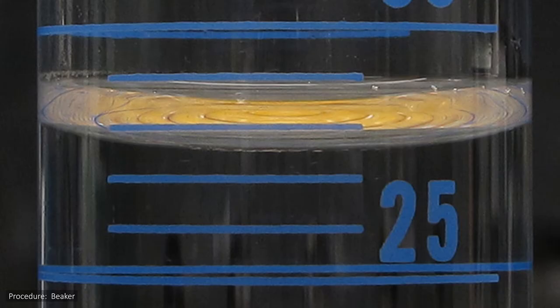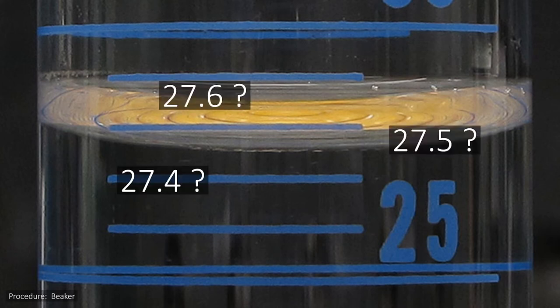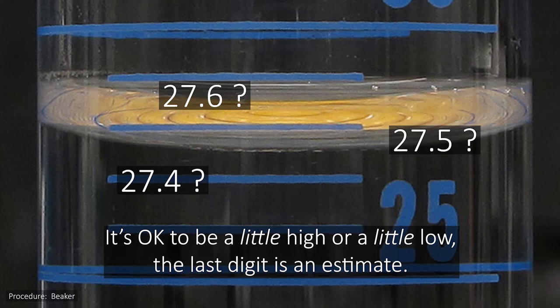If you've never done this before, it can sometimes be a little hard to figure out what the value of that last digit is, especially since the lines I put up on the example cylinder don't really exist. Just do the best you can, and don't worry too much if you read a little high or a little low. Interpolation is, after all, subject to interpretation.